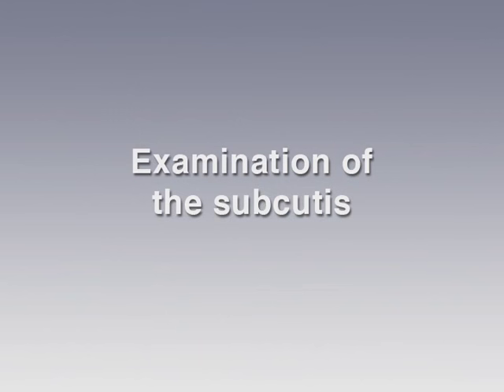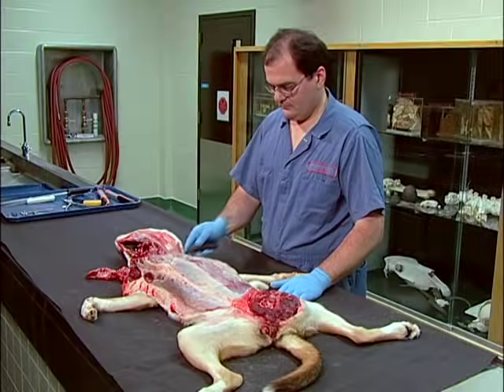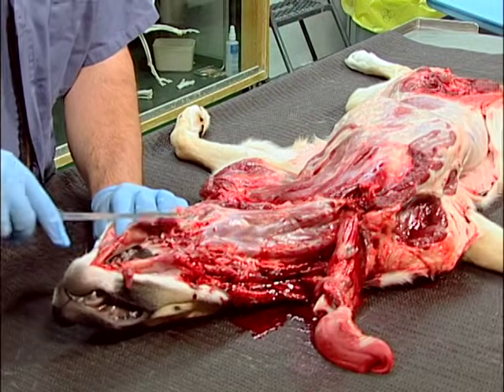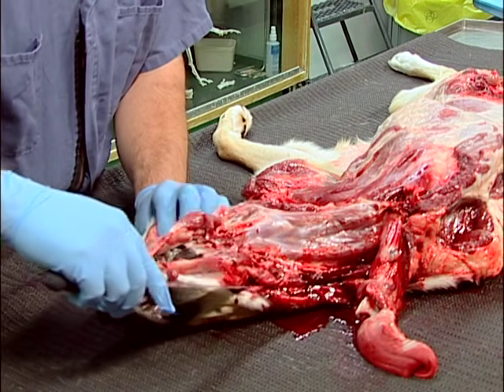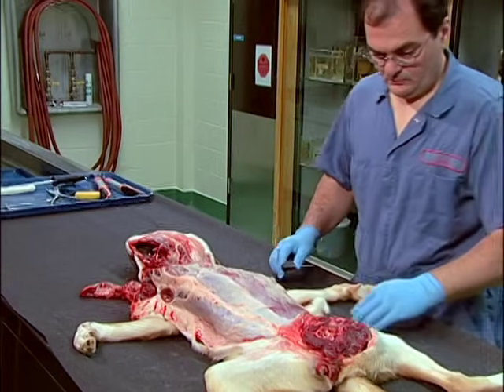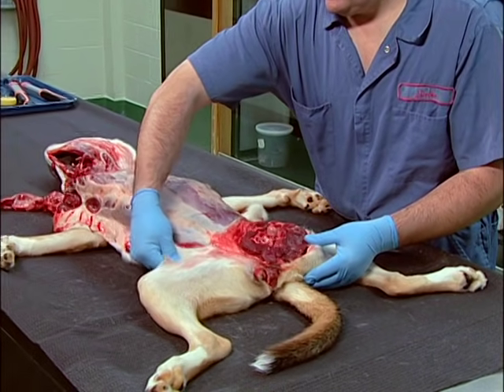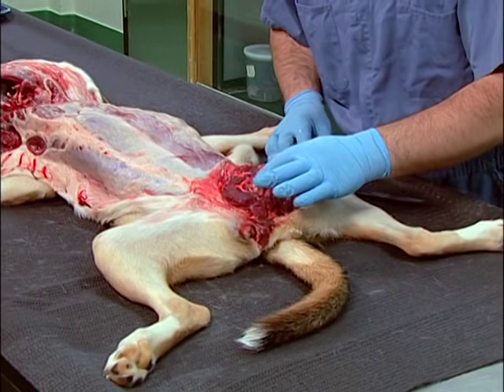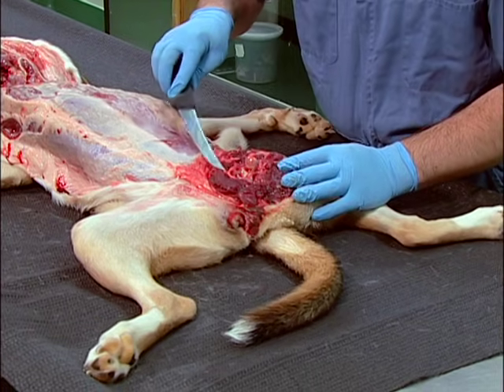Examination of the subcutis. Assess the color and hydration status of the subcutaneous tissue and the abundance of fat reserves. Look for evidence of edema in dependent areas or for the presence of subcutaneous hemorrhages that can be associated with trauma, coagulation disorders, or endothelial damage. Examine the lymph nodes, exposed joints and muscles, and make additional incisions in masticatory, cervical, or other muscle groups if needed.